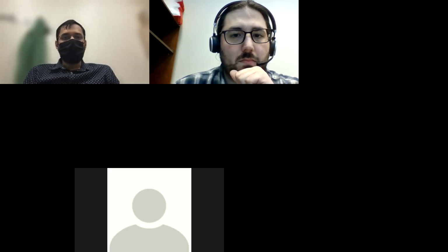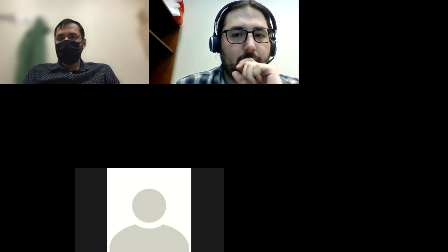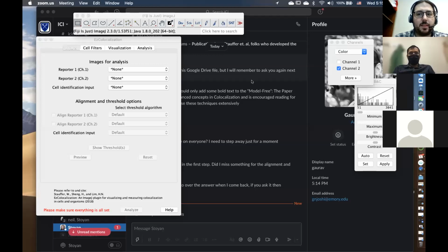So I had to go to analyze, set scale and click to remove scale. If I did not do that, let me go back to the original data set and try to recreate that problem. You're also not seeing your screen. You shared it briefly, but then it went out. Yeah, there it is.